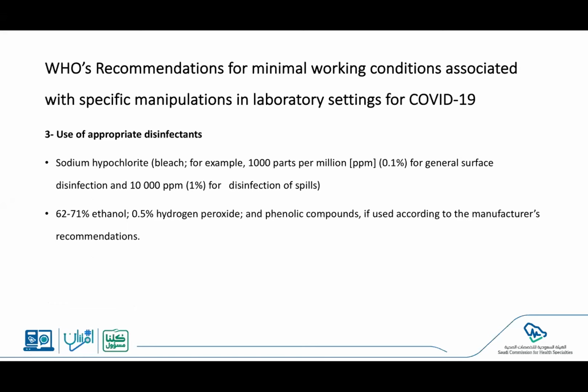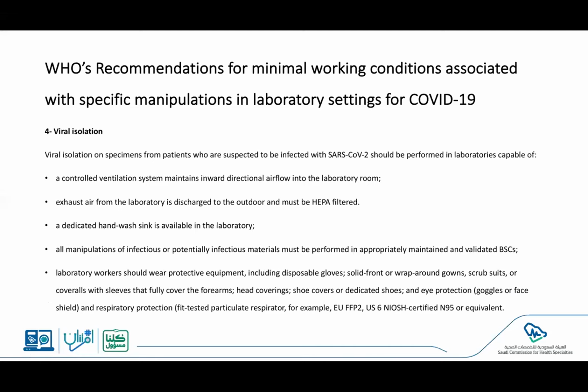Viral isolation is quite important to process, mainly under negative pressure, and that negative pressure is exhausted to the outside environment through a HEPA filter. The laboratory personnel handling the sample for viral isolation purposes, for example RNA extraction in this context for SARS-CoV-2, need to wear appropriate PPE, including N95 masks, disposable gowns, gloves, head cover, shoe cover, eye protection, and so on. Despite all of this equipment, they really need to process it inside a biosafety cabinet.